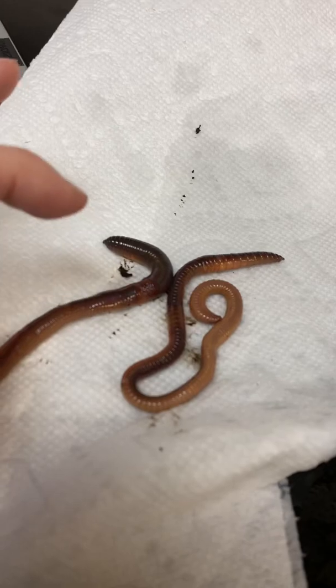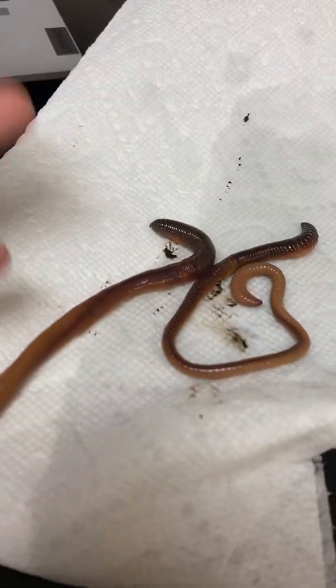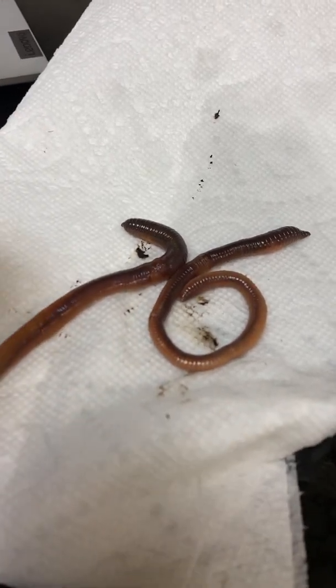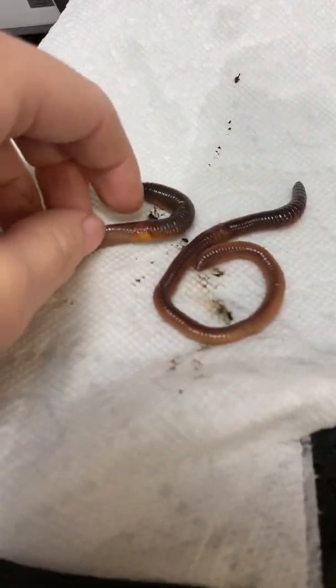Earthworms, so no, you cannot tell the difference. They are all the same because they are hermaphroditic. They're monoecious, so they're both male and female. 29, what is the name of the obvious external reproductive structure you can see in the earthworm? So from the notes yesterday, we learned about that.